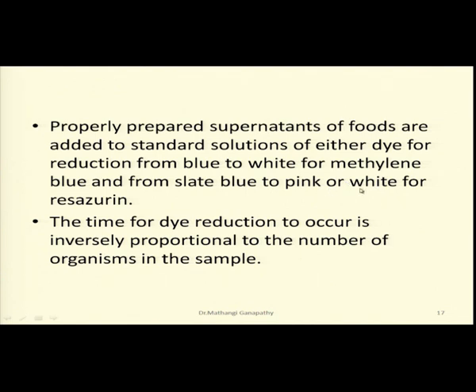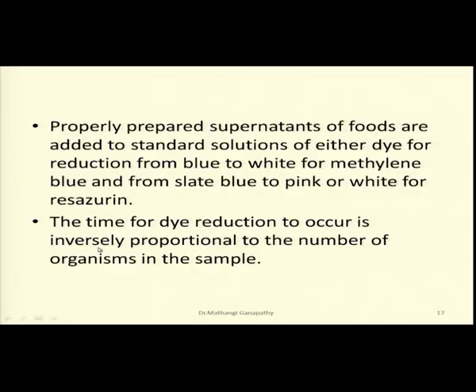This will be a gradual change depending upon how the microbes grow, the rate of microbial growth. So, the moment you add the wash, you are not going to see the color change, but if the food sample contains microbes and you incubate the sample plus dye mixture under optimum conditions, as the microbes start multiplying, replicating, and the enzyme activity starts, you will see the gradual change in the color. The time for dye reduction to occur is inversely proportional to the number of organisms in the sample.